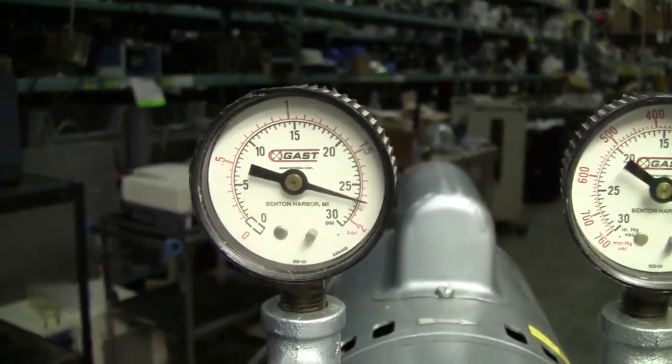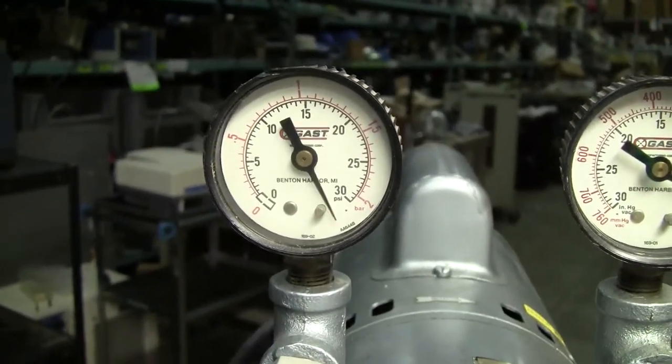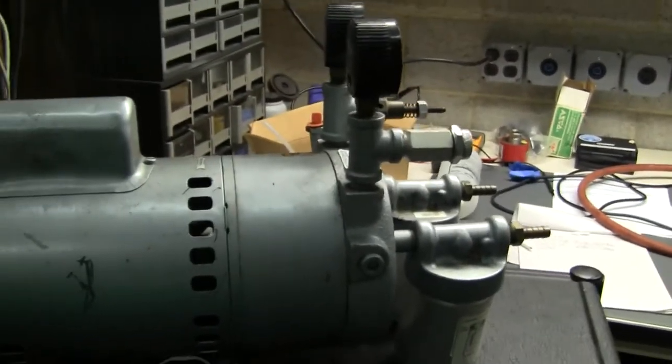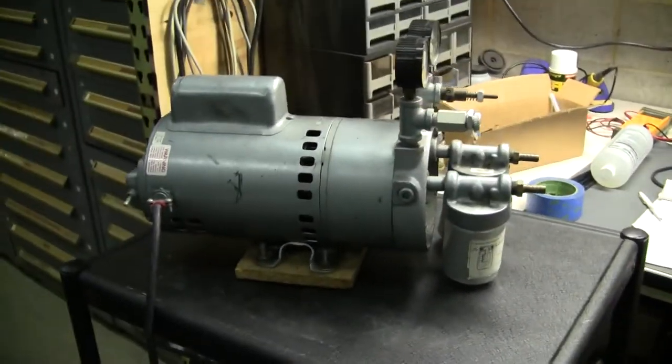Now let's look at the gauge for our PSI. It gives us over 30 PSI from the compressor side.